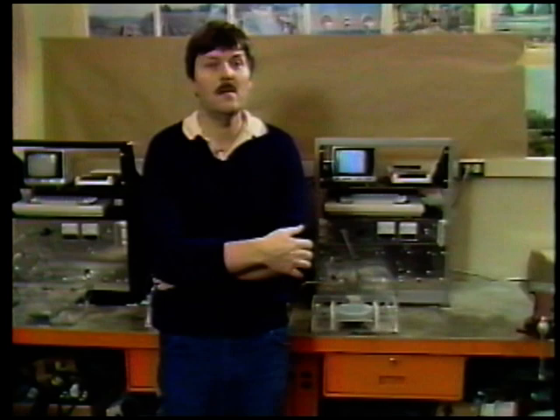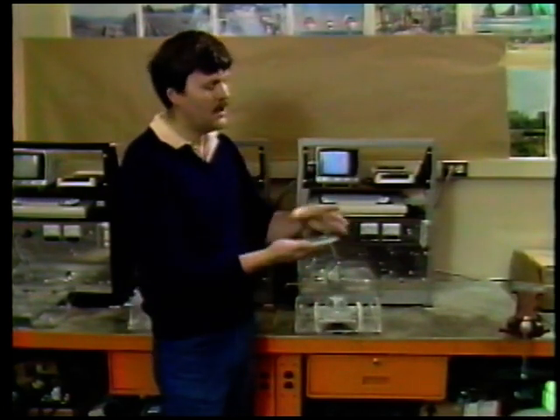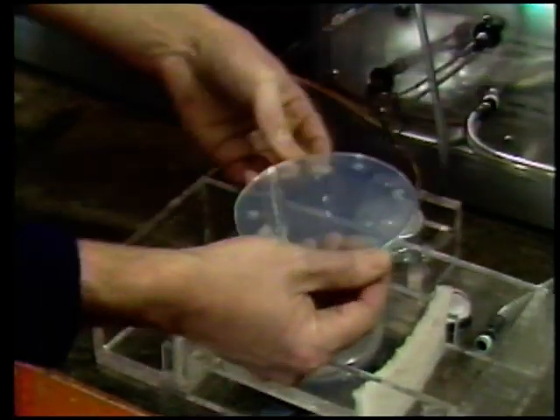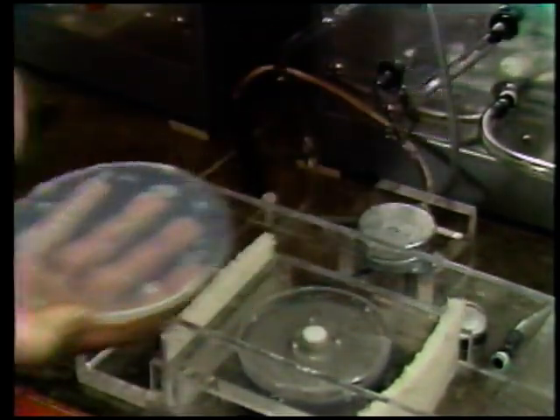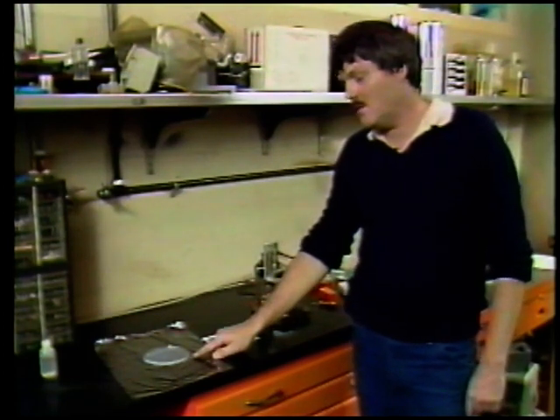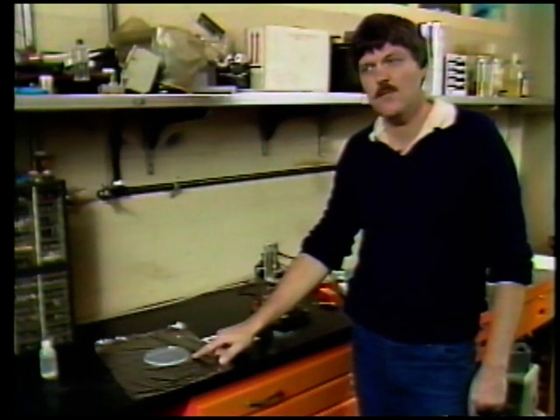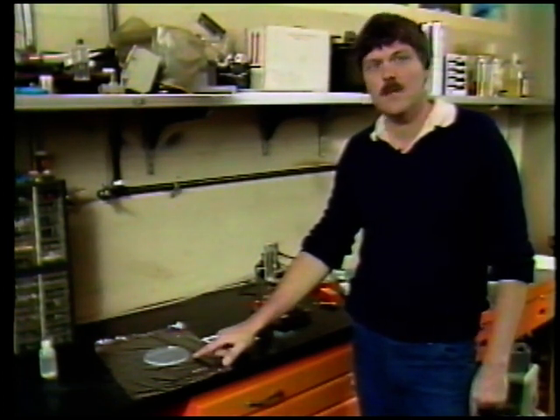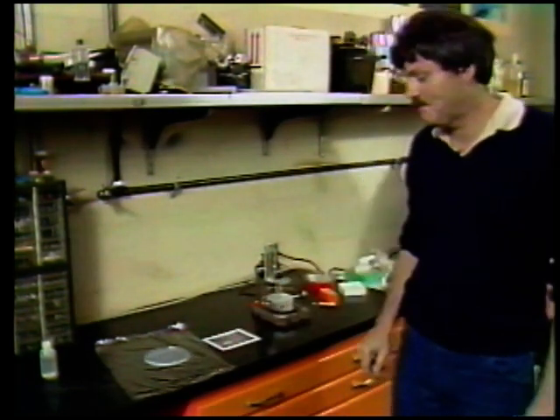An alternate method of slide preparation involves first running a sample of yeast DNA out on an agarose gel in a device we call a rotogel, which is an OFAGE-type tacking gel, a circular gel which rotates between two angles in a dish with a constant directional electric field. This is the agarose gel, which I have removed from the rotogel slide, and I have stained it with ethidium bromide in electrophoresis buffer for 2 hours, and then destained it overnight in electrophoresis buffer also.